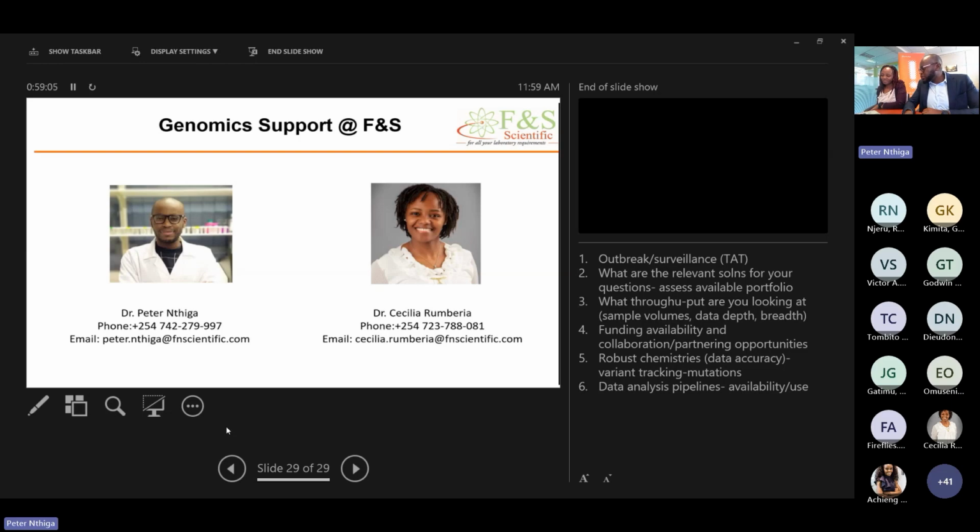So there's another question: does Illumina have access to all data shared on BaseSpace? No, and a big no. We don't have access to your data. So the BaseSpace ecosystem is an ISO certified ecosystem where they have taken a lot of considerations to make sure aspects like data privacy are taken very seriously.